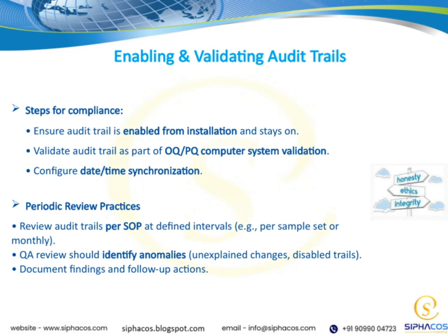And of course, all findings need to be documented carefully, along with any follow-up actions taken. This ongoing review process is key to maintaining compliance and ensuring the integrity of your data over time.